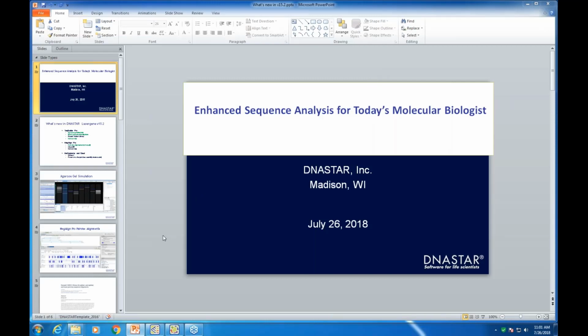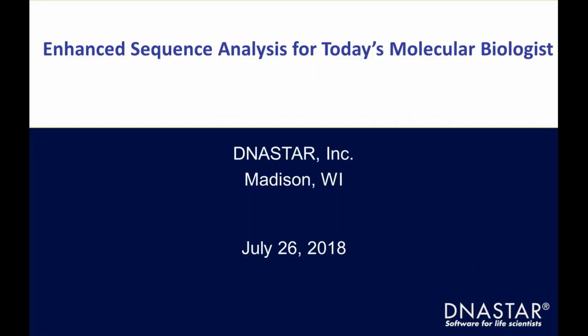I'm going to be showing you some of the new features that were released in LaserGene 15.2 a few weeks ago, and we'll cover some things in detail, and I certainly welcome any questions that you have regarding any of the materials that I cover today.